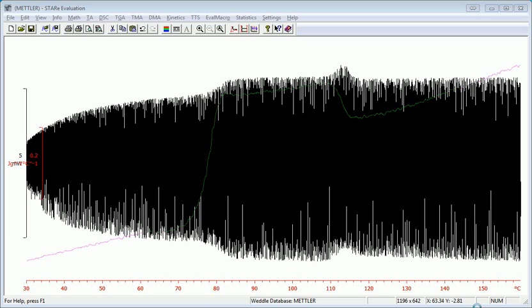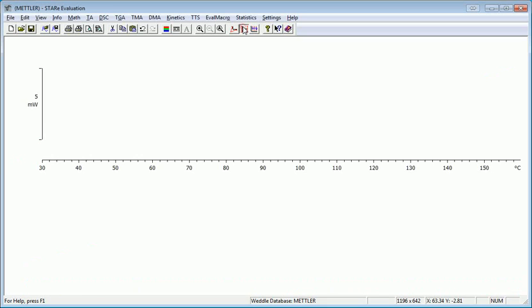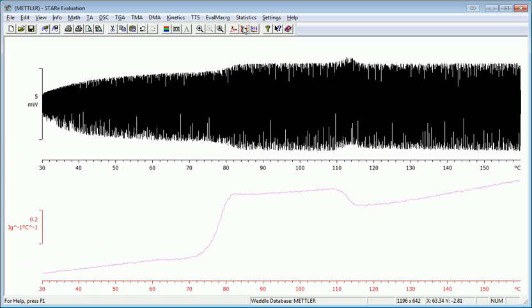Okay, once the deconvolution is done, you see now I have a couple curves on my screen. I'm going to hit the arrange coordinates button to stack them. I have the original data on top and heat capacity data, joules per gram per degree C on the bottom.